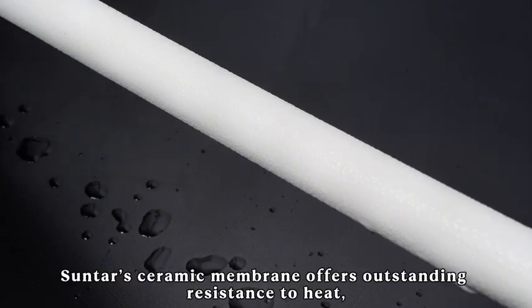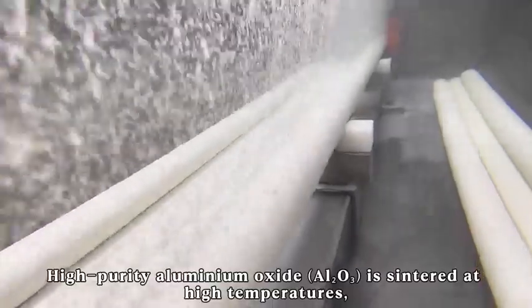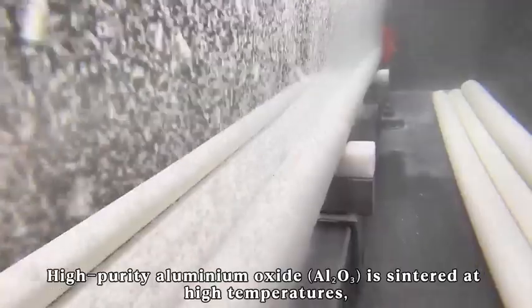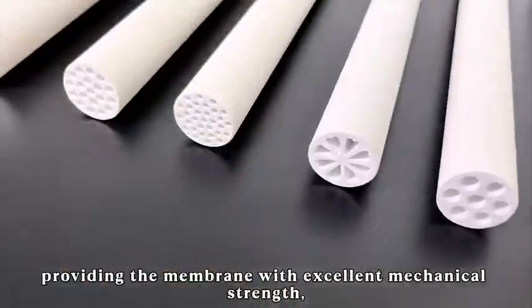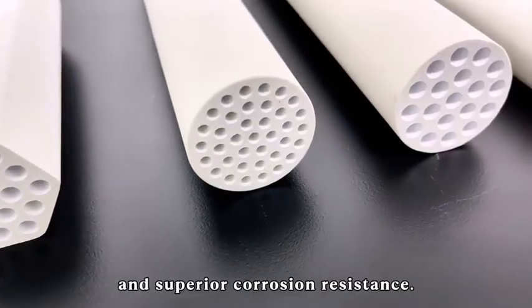Sunter's ceramic membrane offers outstanding resistance to heat, corrosion, and mechanical stress. High purity aluminum oxide is sintered at high temperatures, providing the membrane with excellent mechanical strength and superior corrosion resistance.